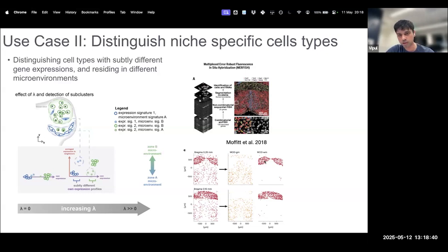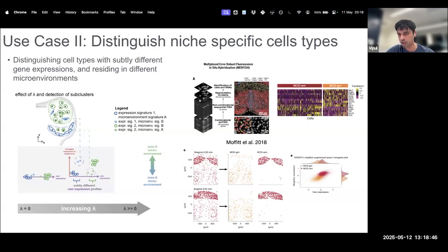So the first question you ask, okay, are there DE genes that are different between these two subpopulations? And what are those genes associated with, right? So we found that the gray matter DE genes were generally associated with signaling type roles, and the white matter ones, the anterior commissure ones, were related to myelination, right, as you might expect.